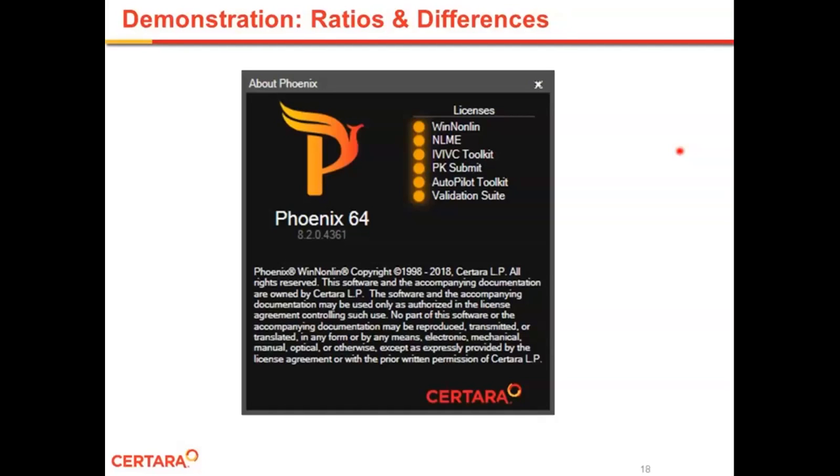Looks like there's one last ratios question. Someone says, in the ratio example you showed, you used the filter, but if the data are in different worksheets, is it necessary to use the filter setting?